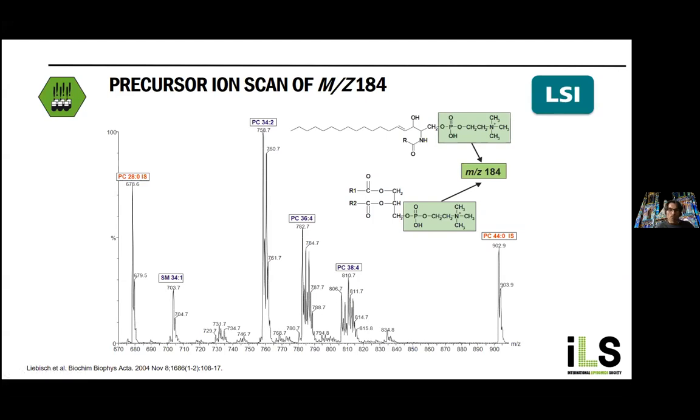So you can easily imagine that you have some kind of isotopic overlap, which you have to deconvolute, and I will show you that on the next slides. So it's not so straightforward to just pick the intensities and have accurate values. You have to really do some data deconvolution to have exact concentrations.